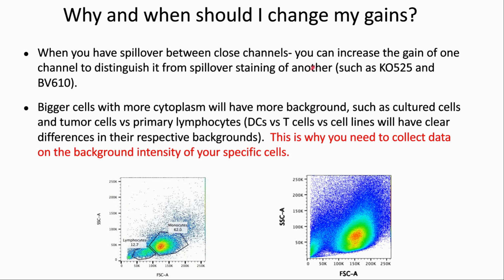Also, a signal cannot be rescued if it falls back into the negative population. In this situation, the data is the data. This is why, again, we recommend starting from the QC recommended gains and moving from there.